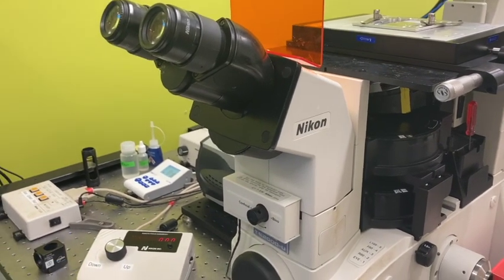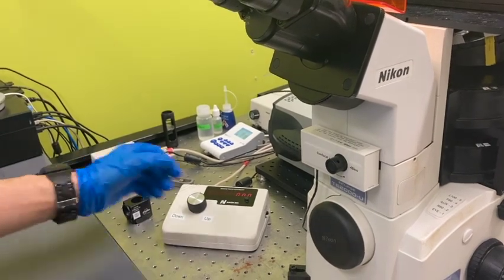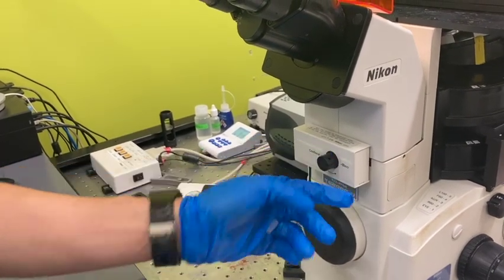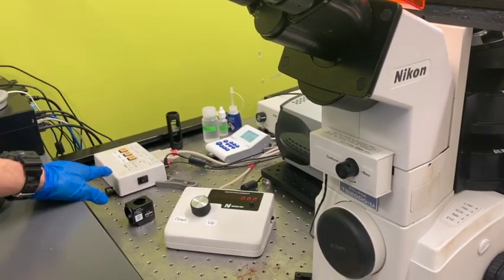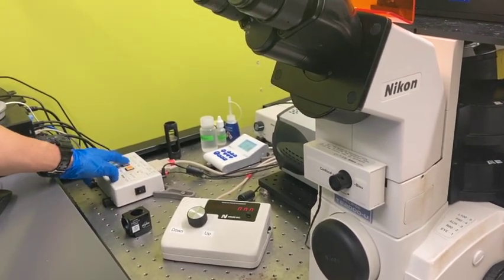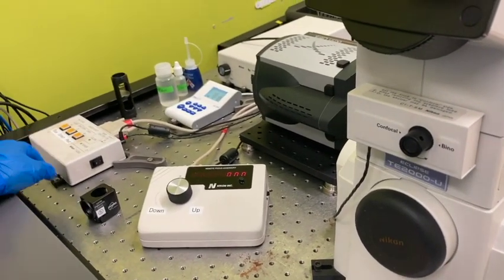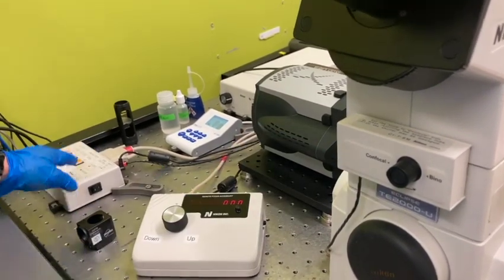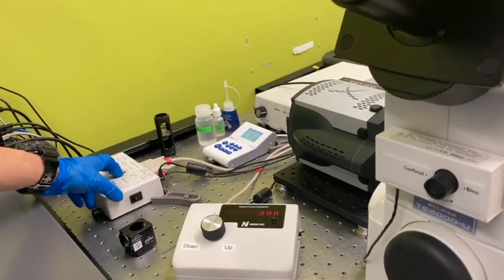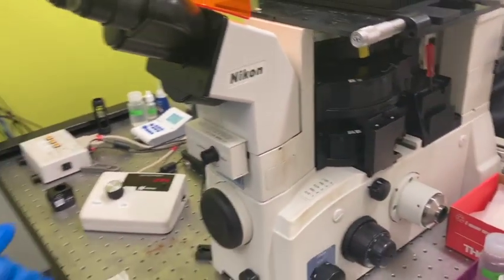In that case, this system will force the laser to turn off, which means if you switch this to bino, the laser is going to be forced off, and you lose control. So make sure you switch it back to the confocal, and then you can have red, green, and blue going out. And yeah, that's the trick.